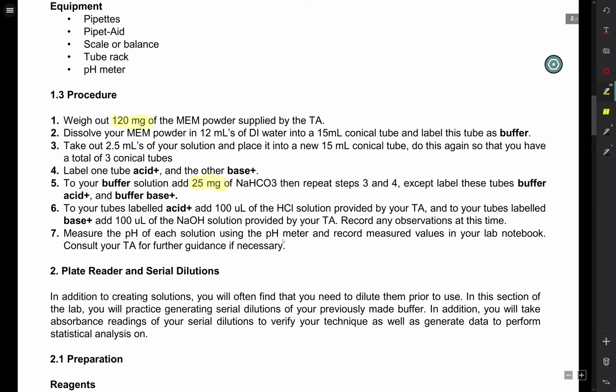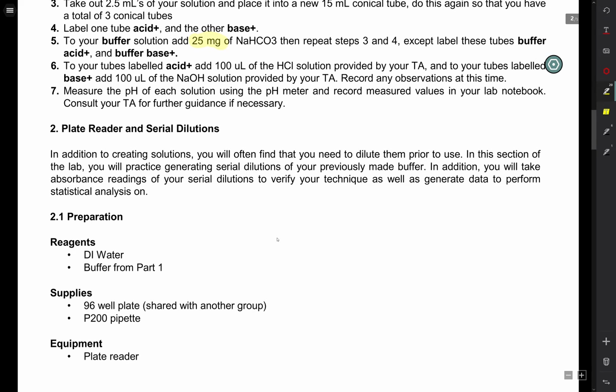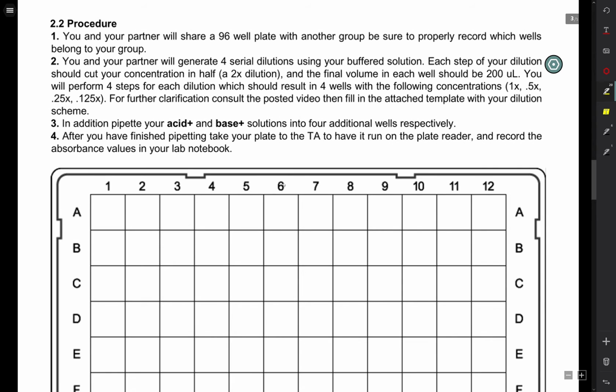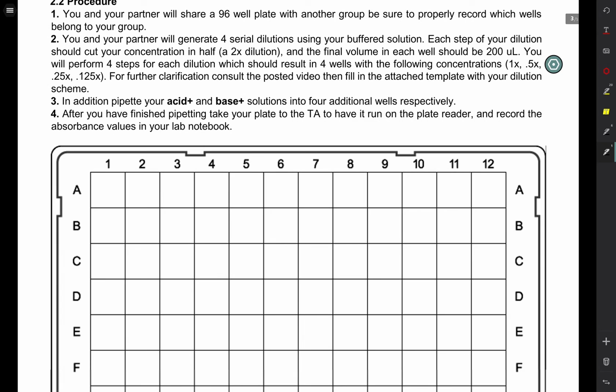In the second part of the lab, you will be using the buffered solutions you create in the first part of the lab to generate a serial dilution. This is meant as practice, so please have both you and your partner do this. For example, because you want to have 200 microliters in each well at the end, what you're going to want to do is something like add 400 microliters of your solution into well 1. Into the other wells, so in this case 2, 3, and 4, you're going to want to add 200 microliters of your dilutant, which is DI water, first.